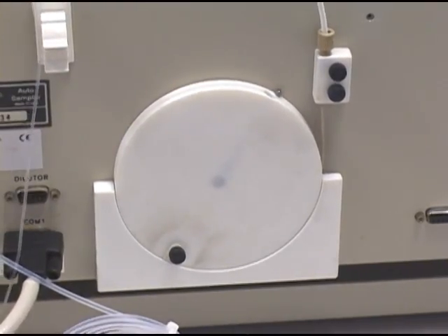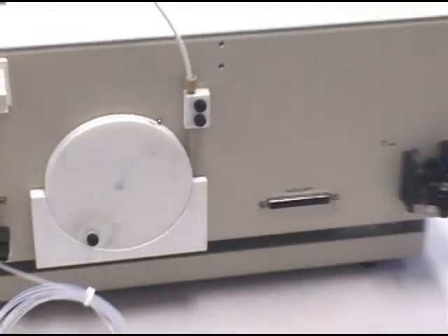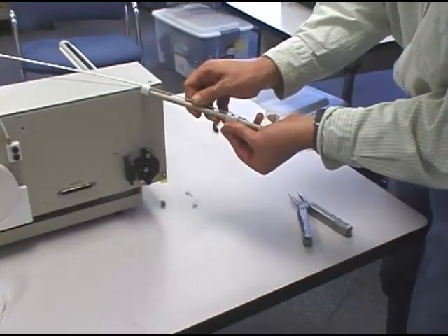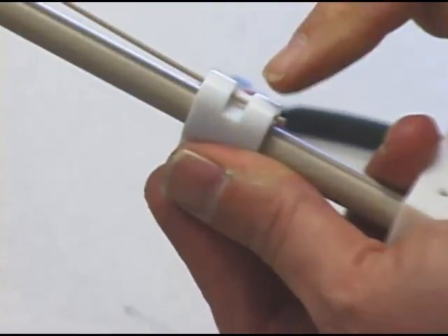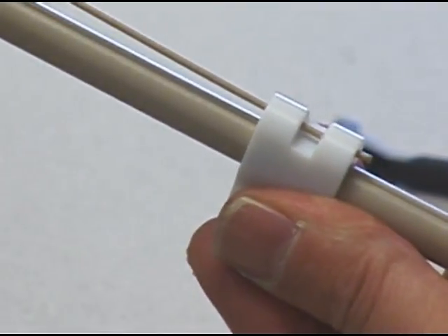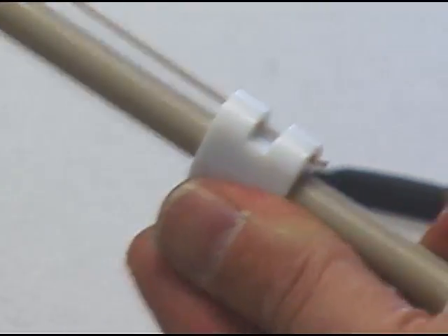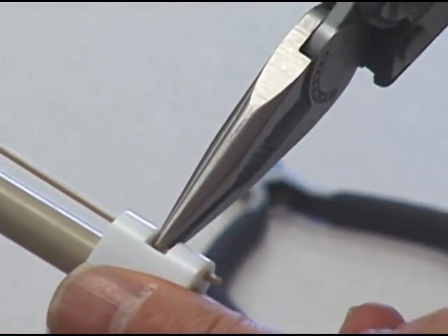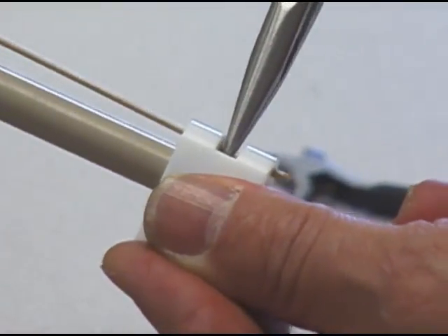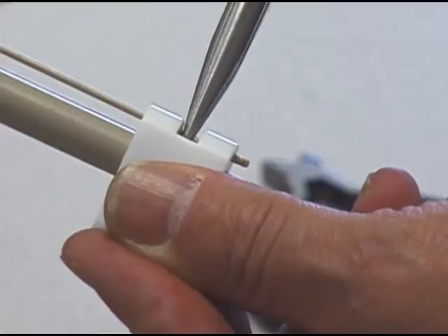Now we need to crimp the new peak tubing into the slider. I'll run the peak tubing into this linkage, take a pair of needle nose pliers — there are a couple of ways to do this. We'll crimp it first in the middle. You'll have to apply a bit of pressure, and try to get a crimp on both sides of that gap.